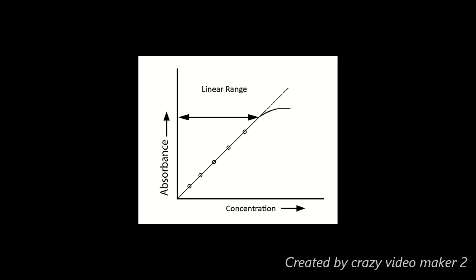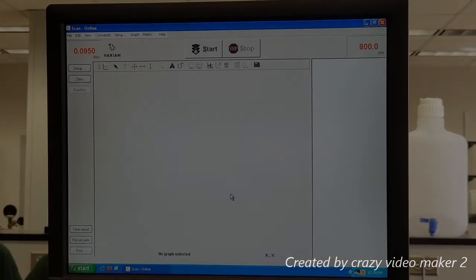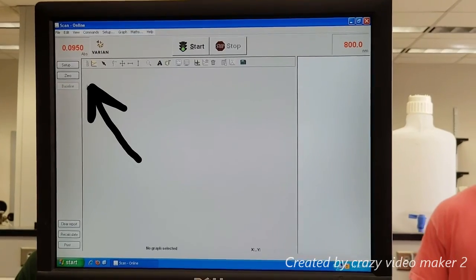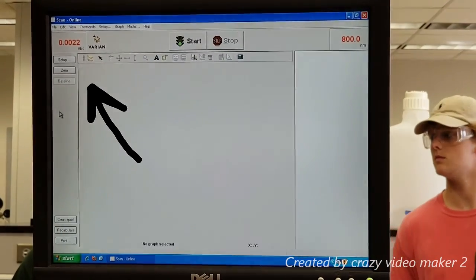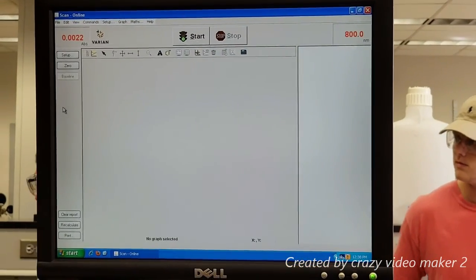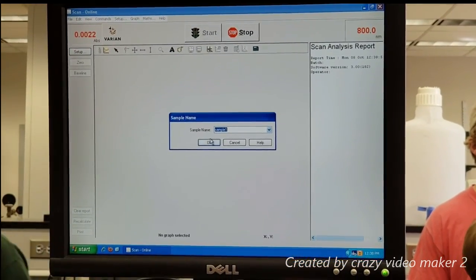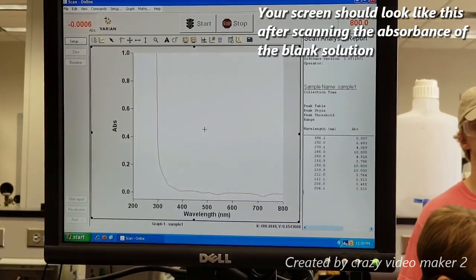There is a direct relationship between absorbance and concentration, meaning that when the concentration increases, the absorbance will also increase. You should also zero the machine with a blank before you go through your solutions in order to have a control to compare your other values to. If you don't do this, your data might be skewed because of environmental changes like temperature or previous groups measuring their solutions.